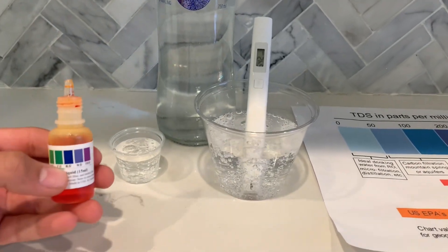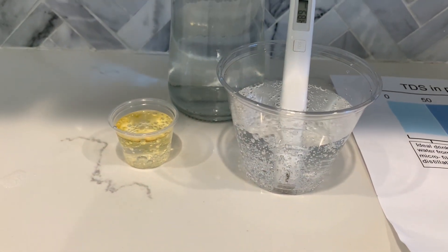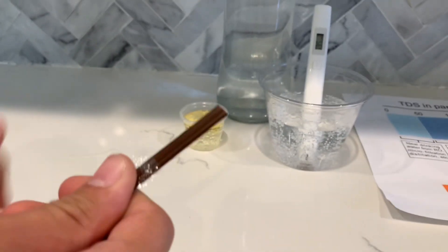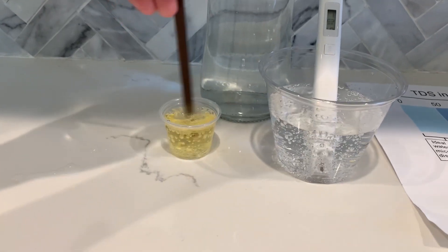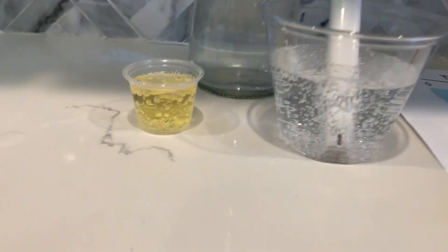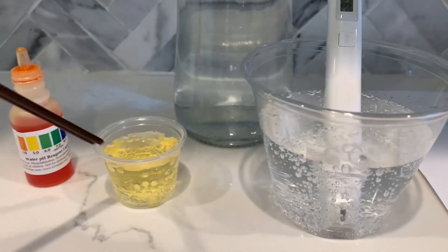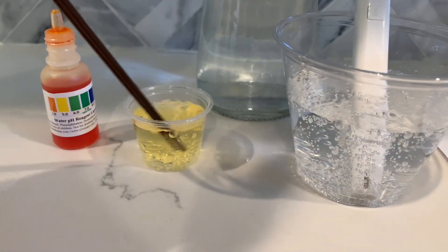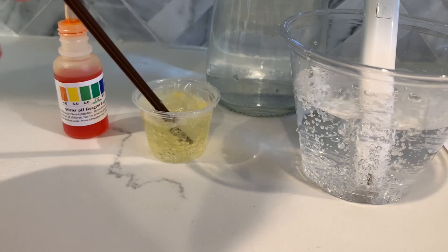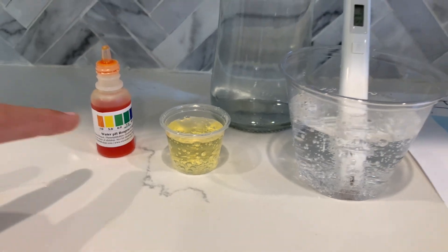Now, let's test the pH level. Do two to three drops. Let's stir it a little for a better result. Right now, it's around a five. Let me blow on the water and see if the results change. The results didn't change much — I think it's still a five.